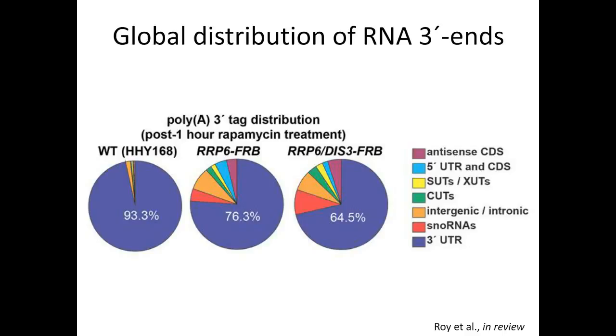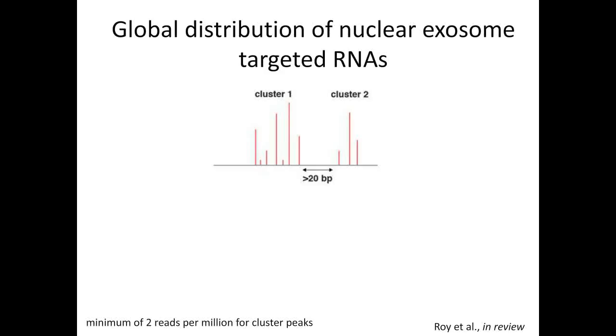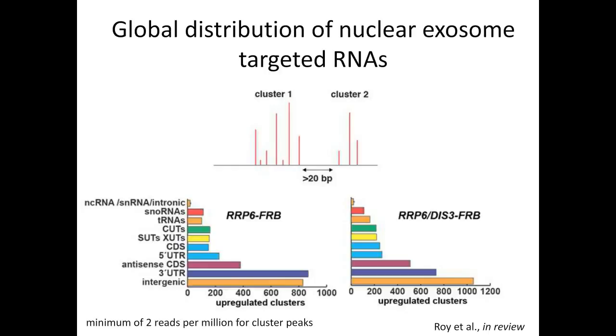So we went forward with this approach, and we looked at the total nuclear exosome targeted RNAs. We wanted to determine where they were mapping and what types of genes are targeted by the nuclear exosome. So we clustered these poly-A sites, and we chose to cluster poly-A sites that were within 20 base pairs of one another; when they were separated by greater than 20 base pairs, they were called as different clusters. We chose a cutoff of 2 reads per million for the cluster peaks.